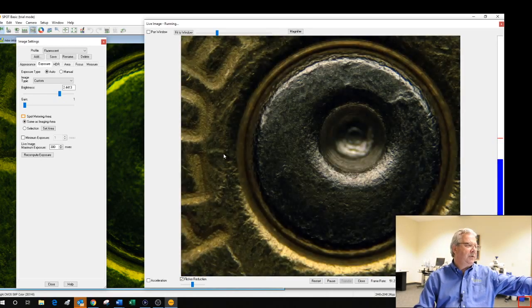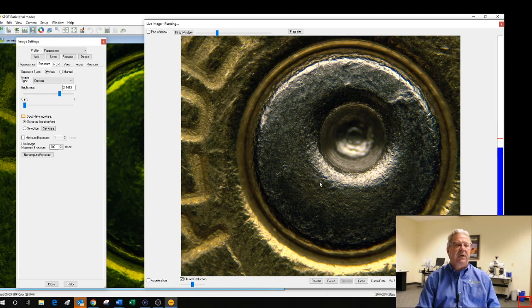And I'm going to go back now to my fluorescent light. It's got the right white balance to it, and I'm going to hit save. Now, whenever I am going to use the fluorescent lighting, if I have permissions to the spot imaging folder and I've selected fluorescent, if I previously white balanced it, then it'll be white balanced again when you open it up. If it's not, that's where we need those permissions to that folder.